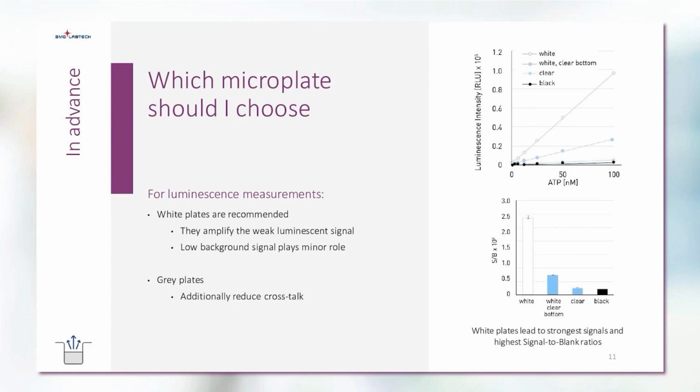It also has to be mentioned that there are gray plates available on the market, and next to signal amplification, those plates additionally reduce the well-to-well crosstalk.